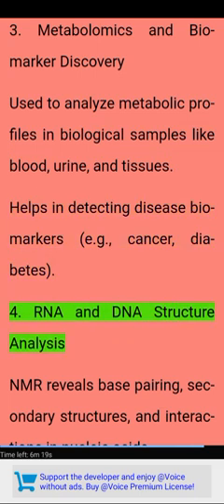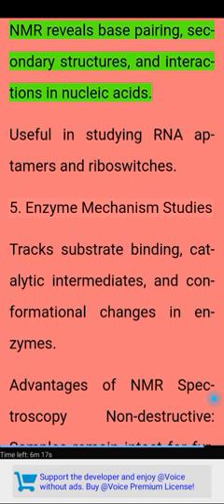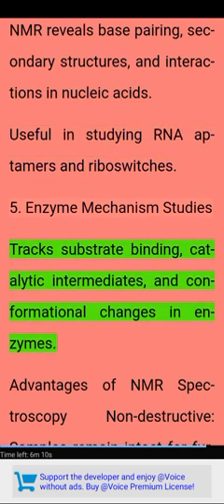4. RNA and DNA structure analysis. NMR reveals base pairing, secondary structures, and interactions in nucleic acids. Useful in studying RNA aptamers and riboswitches. 5. Enzyme mechanism studies. Tracks substrate binding, catalytic intermediates, and conformational changes in enzymes.